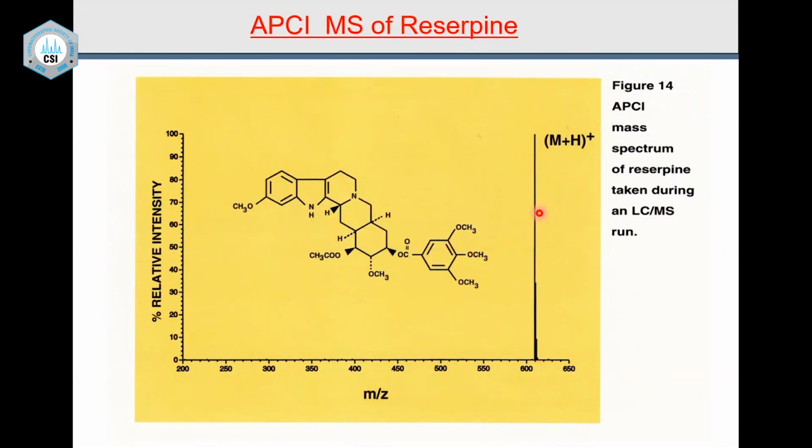In fact, to tune the mass spectrometer, we sometimes use reserpine. Reserpine is a natural product, you remember, from Rauwolfia, we take it from the root of this plant, and reserpine is a very, very important compound in tuning of this mass spectrometer. And when you go to protein molecules, we use myoglobin to tune the mass spectrometer. Once it gives myoglobin very well, then we can say the mass spectrometer is in good condition and we can use it for other molecules.